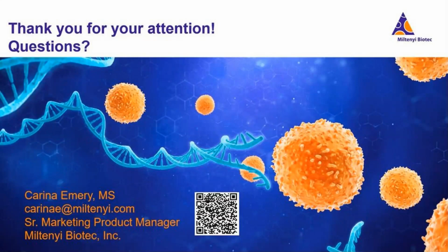So you don't need the gentleMACS for that. They are pretty easy to lyse. You can use our nuclei extraction buffer. Just incubating in the lysis buffer on ice is probably enough to lyse the PBMCs because they're fairly easy to lyse.